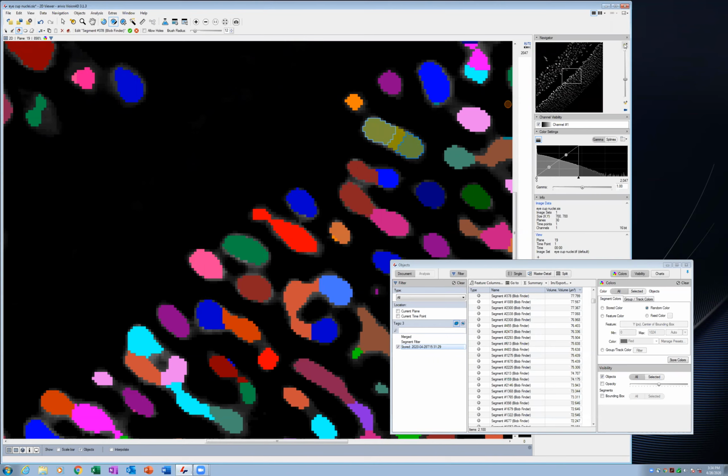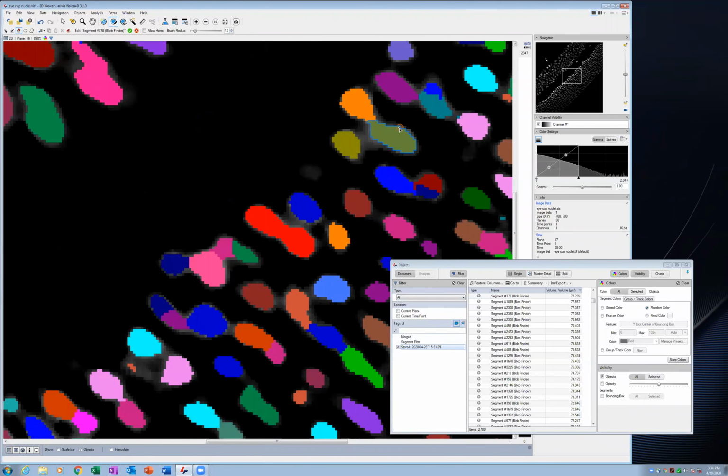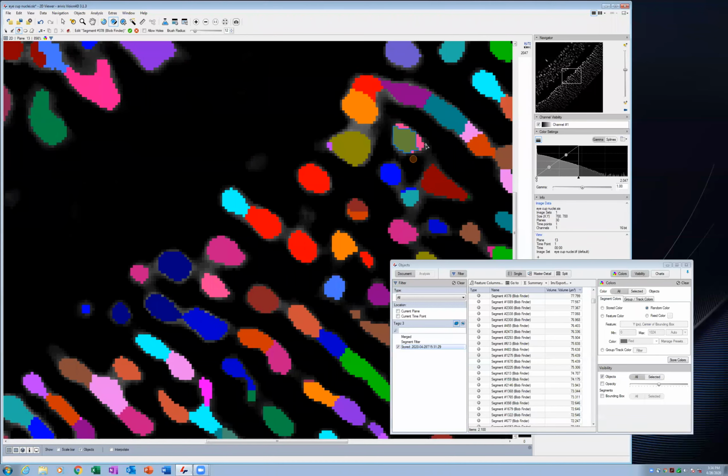And you just have to go through and cut it in half on every plane, okay? And if you do that all the way through it, and then in the end, you hit the checkbox, and then it'll split it into 2 objects. It's still connected at the bottom, that's why they're staying the same color. But if you've done that all the way through, it would split it into 2.